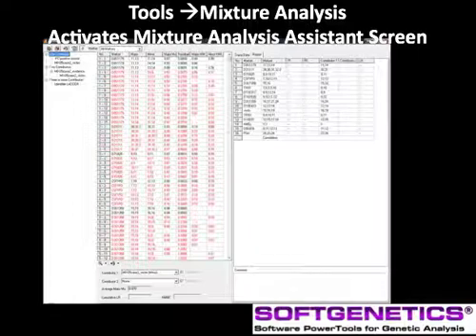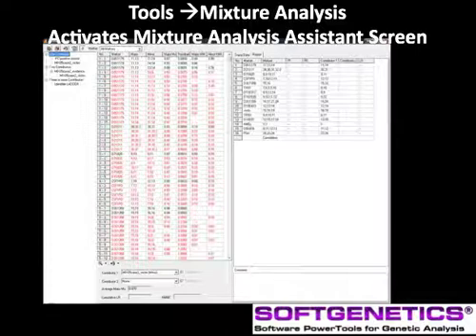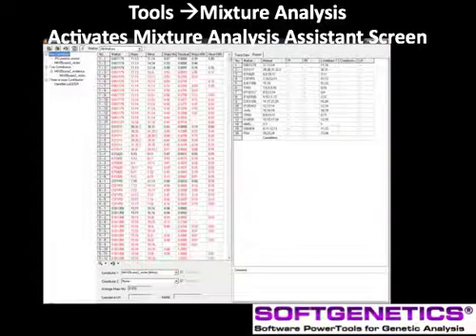The automated calculations for files with three or more contributors include PI, PE, CPI, CPE, and RMNE.